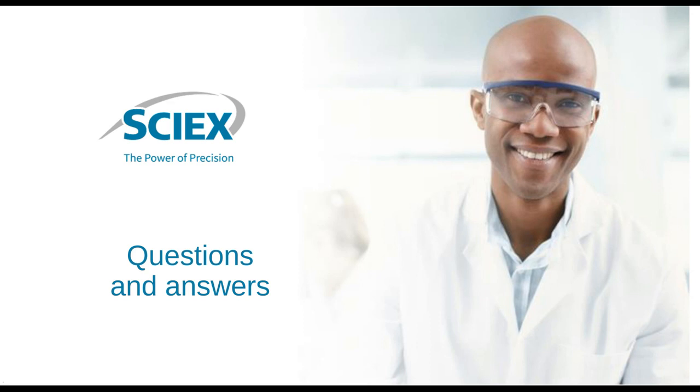We will start with this first question. Are these low sensitivities exclusive to LIF detection? And what can be achieved with PDA detection?